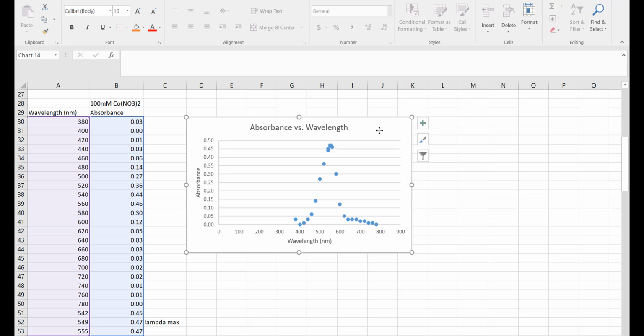These chemicals here are colored, so I would expect within the visible region there is a color that's being absorbed. This time it's absorbing like a 540, 550 wavelength or so. The absorbed color here is like a greenish color. The opposite side is actually more so a red color, which is what we end up seeing. Some chemicals will actually show more than one peak. You just want to choose the one that gives you the strongest signal because that'll be the easiest one to work with later on. So that pretty much here is part one.